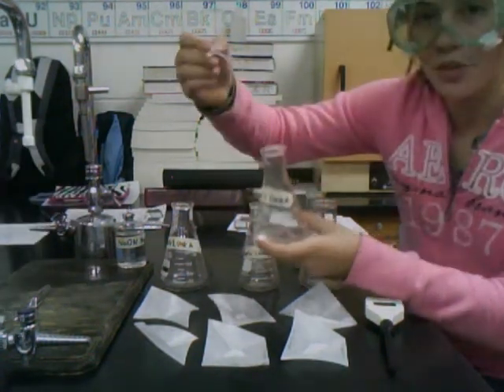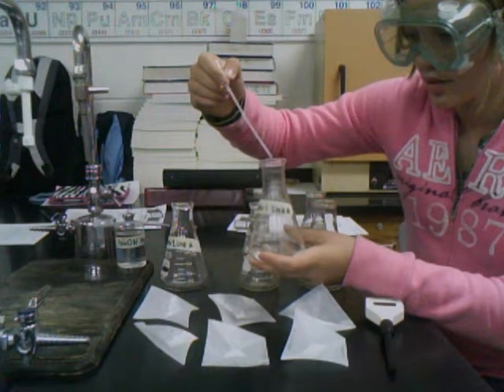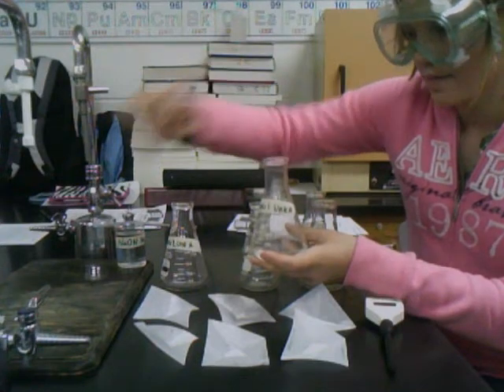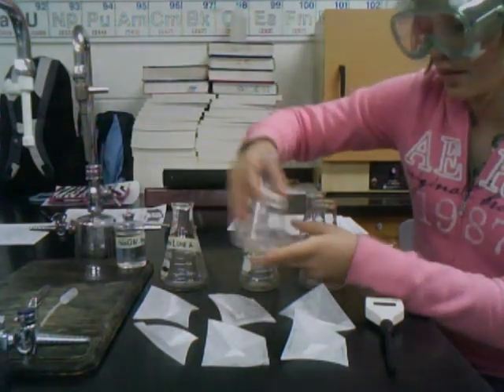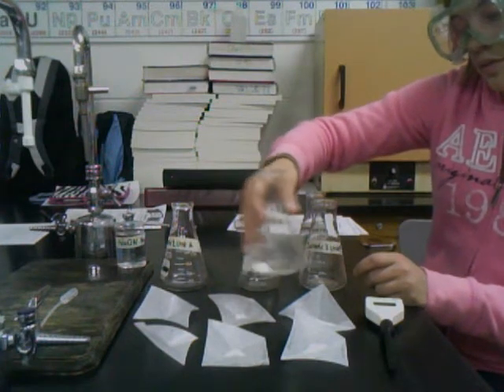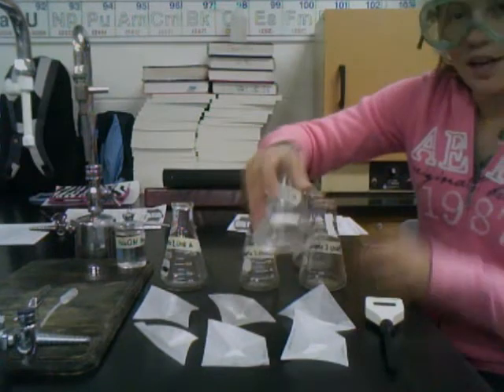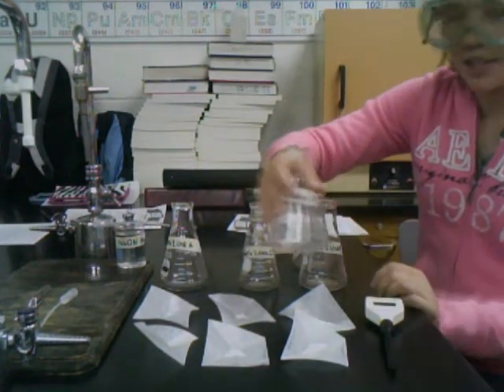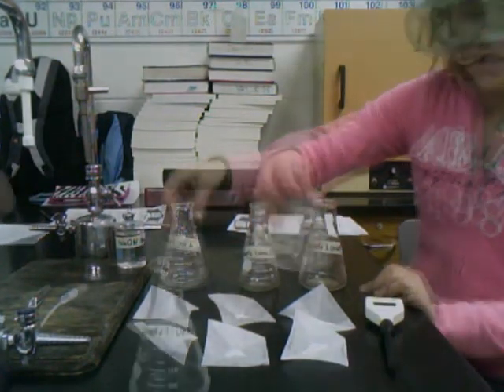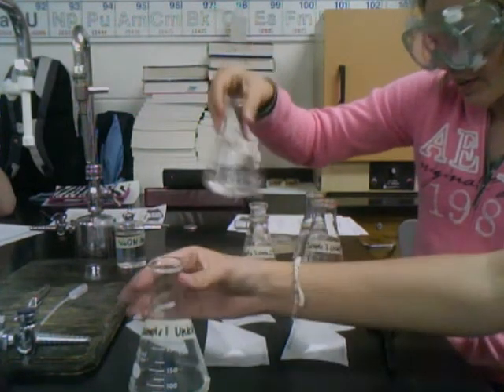I'm adding three to four drops of phenolphthalein to our solution. We're also going to do this a second time so we'll have a second sample. We're going to begin titrating with our 0.1 molar sodium hydroxide.